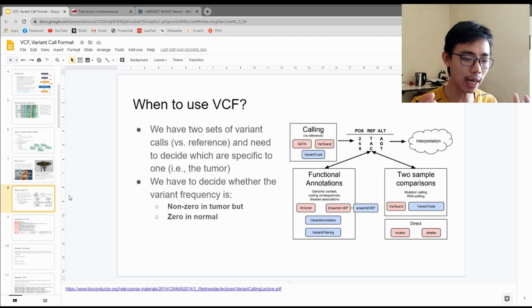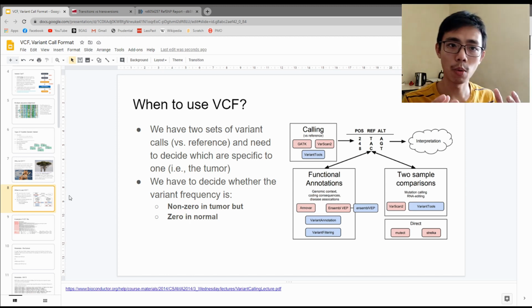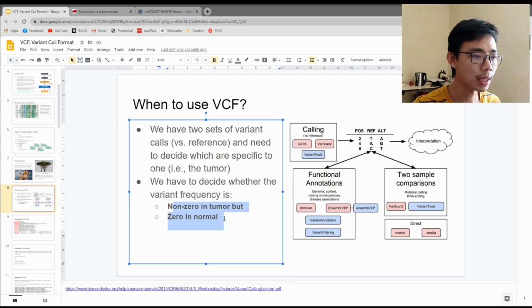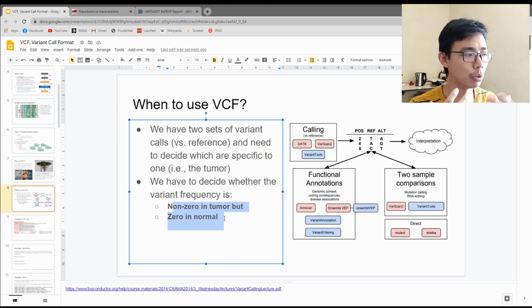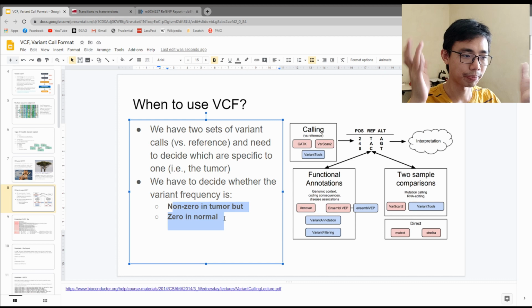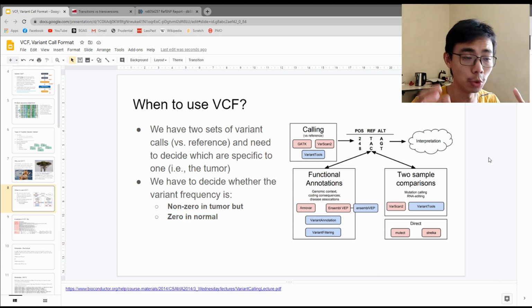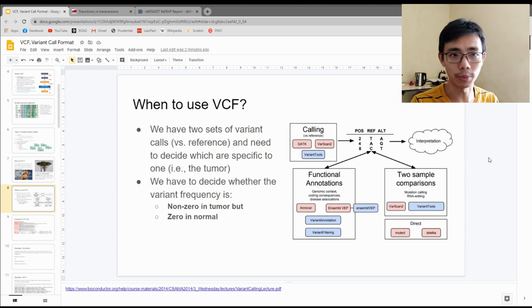Okay, so once we are able to put the two together, we align them to the reference and look at the mutations between them, you can very easily isolate which is the tumor cell and which is the normal cell just based on the number of mutations alone. Because a lot of the time, tumor cells have a lot more mutations compared to normal cells, which is why they're completely whacked up in their genome, which is why they become a tumor. So these are just a whole bunch of tools you can use to generate the VCF file or to analyze the VCF file and so on and so forth.